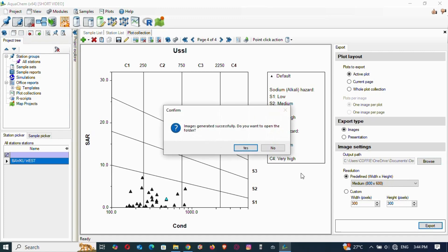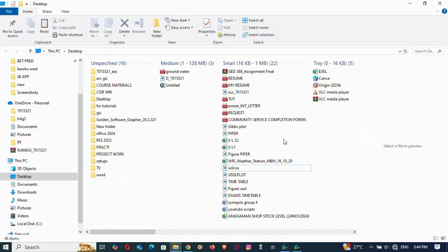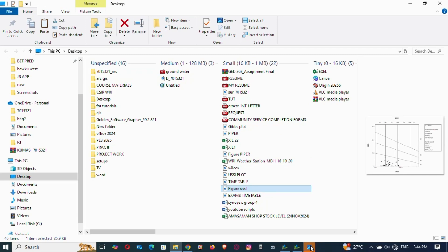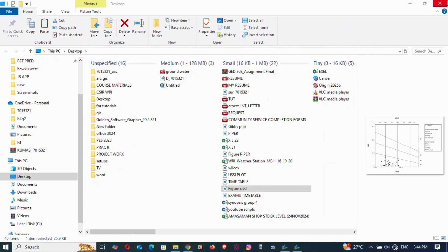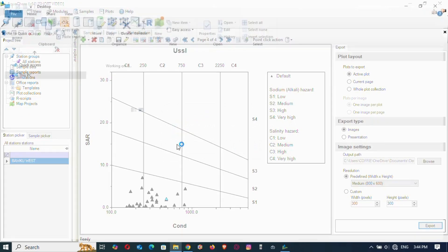Export it and open it to see what we have. There it is — figure USSL. We are done with the USSL. This is how to use AquaChem to plot both the USSL diagram and the Piper plot. We are done with the USSL and AquaChem.